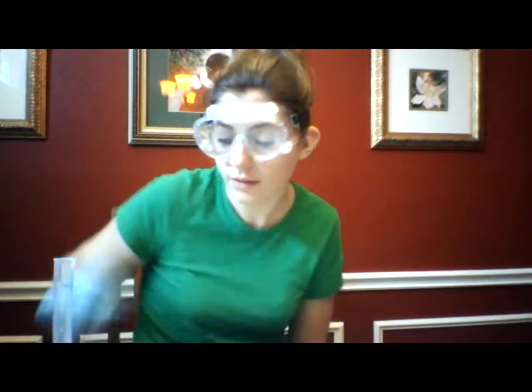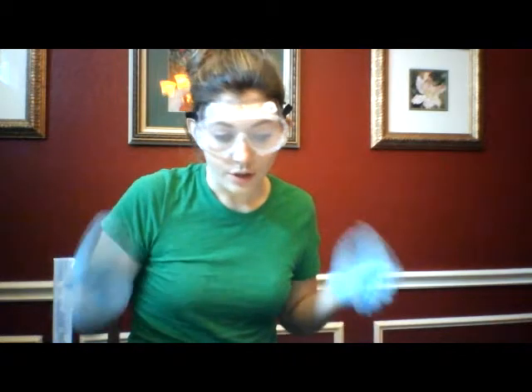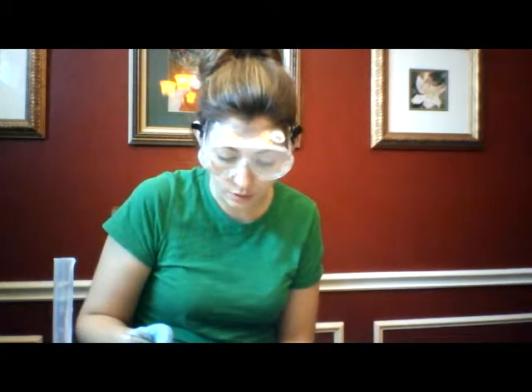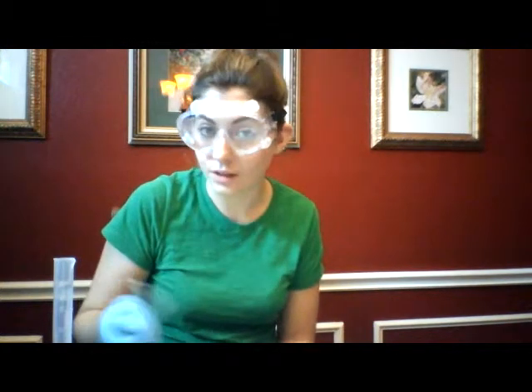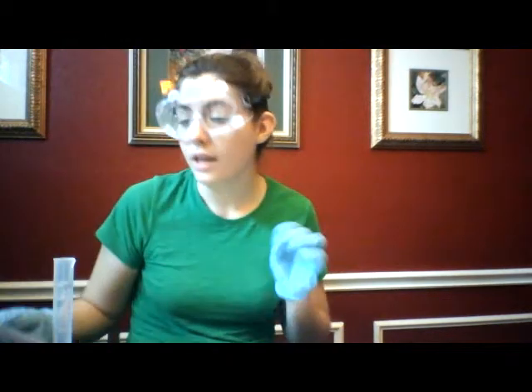I'll be completing the Qualitative Anion test lab. I believe this is lab number 4. So, we're going to be testing bromide, carbonate, chloride, iodine, phosphate, sulfate, sulfide, and an unknown substance, which we'll figure out based on the results from our known substances.